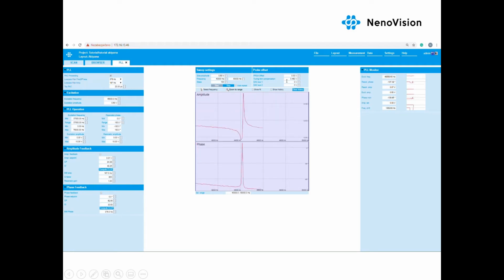The tuning fork of each probe requires different compensation, which we need to adjust in the probe offset box. If we have a look at the amplitude values, it should be around 0.5. We need to increase the sine amplitude value in sweep settings. Also, the frequency range is too broad for exact resonant frequency determination.